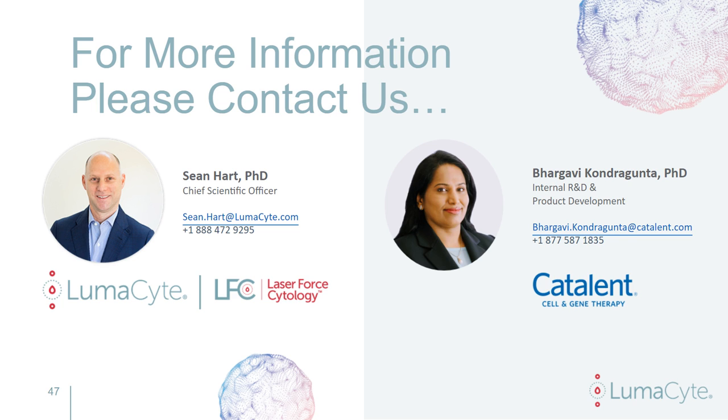Because the plaque is the clearing of the cell. Not only have they been infected, but they've run their course and disintegrated, leaving that clear area on the monolayer. And we're detecting subtle changes in cells, subtle morphologic, biophysical, and then the biochemical differences, as I mentioned, that give us the ability to really detect much sooner.